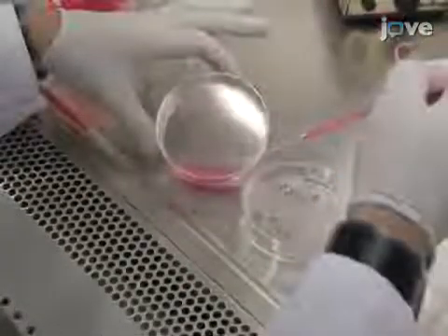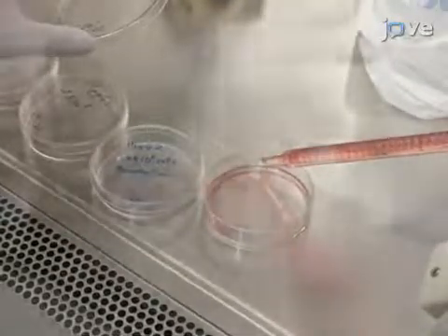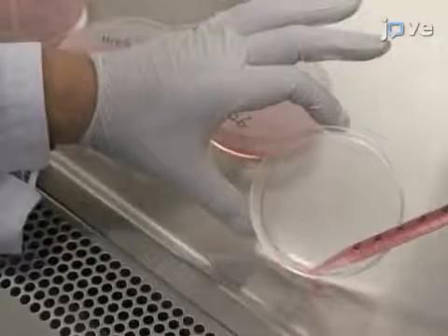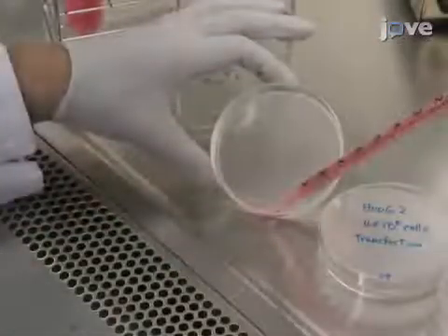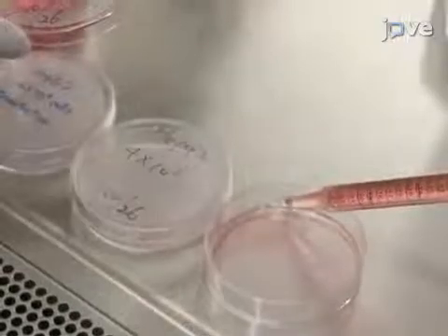The next day, remove the culture medium and add 10 milliliters of fresh culture medium. Then, 1 week after transfection, transfer the culture medium containing the recombinant HBV to a 50 milliliter tube. Next, add 10 milliliters of fresh culture medium to the plate containing transfected cells.